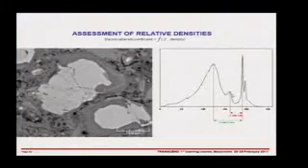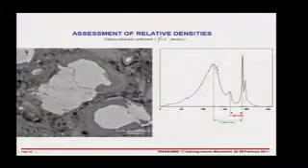So I said it was difficult to extract calcium hydroxide, but the peak you get from calcium hydroxide is very reproducible. And by measuring this distance here and this distance here, and then the ratio of one to the other, you can get a very reproducible fix for what is the position of this CSH peak here.